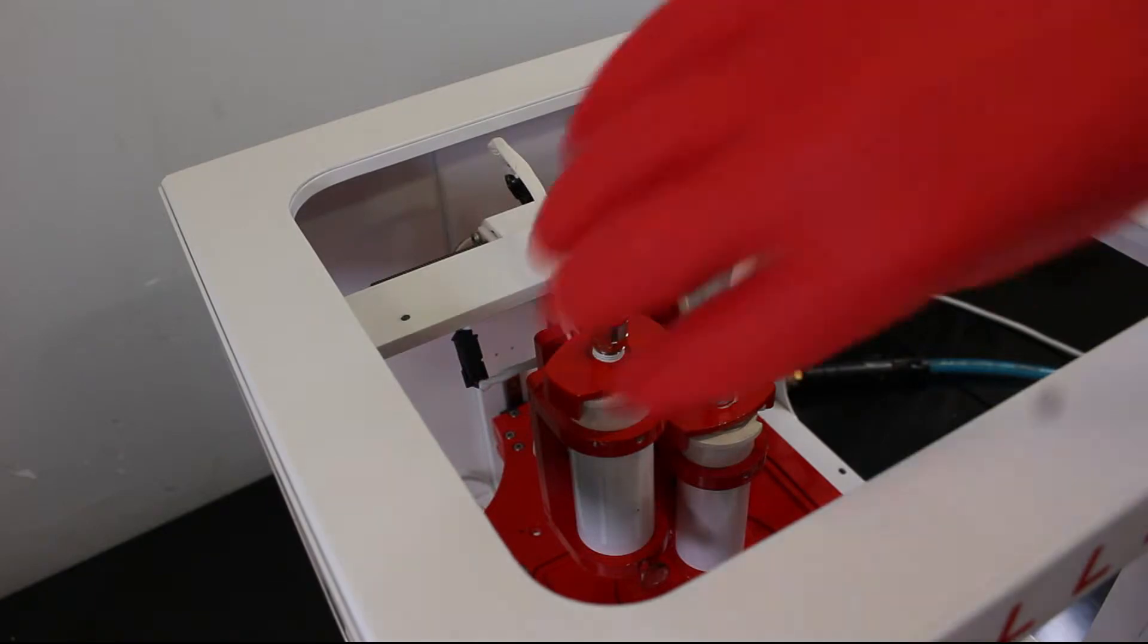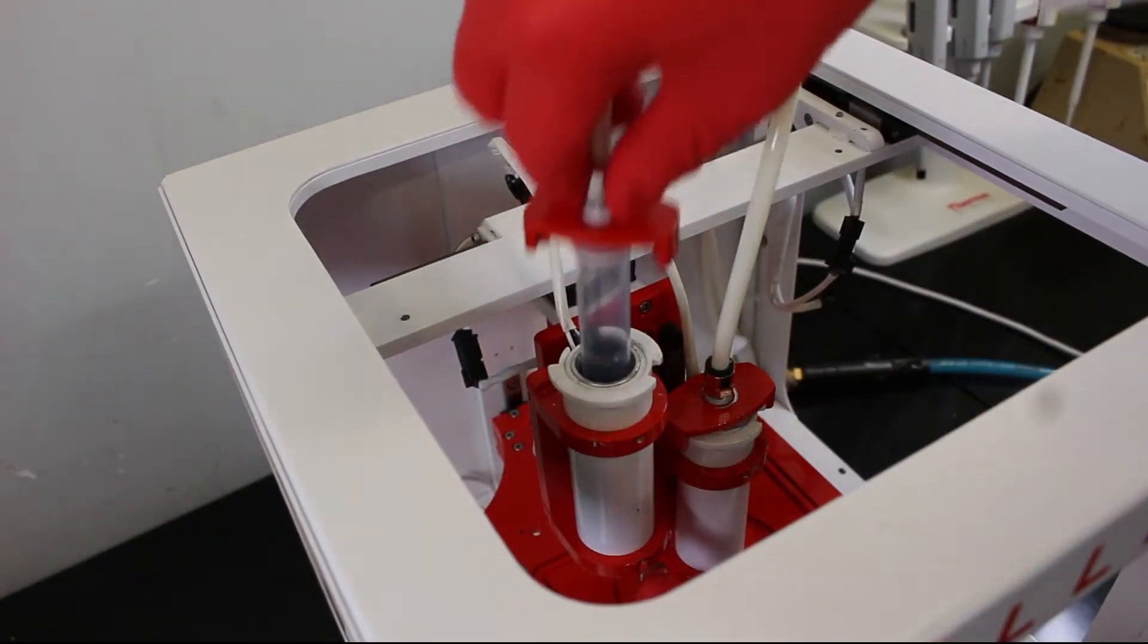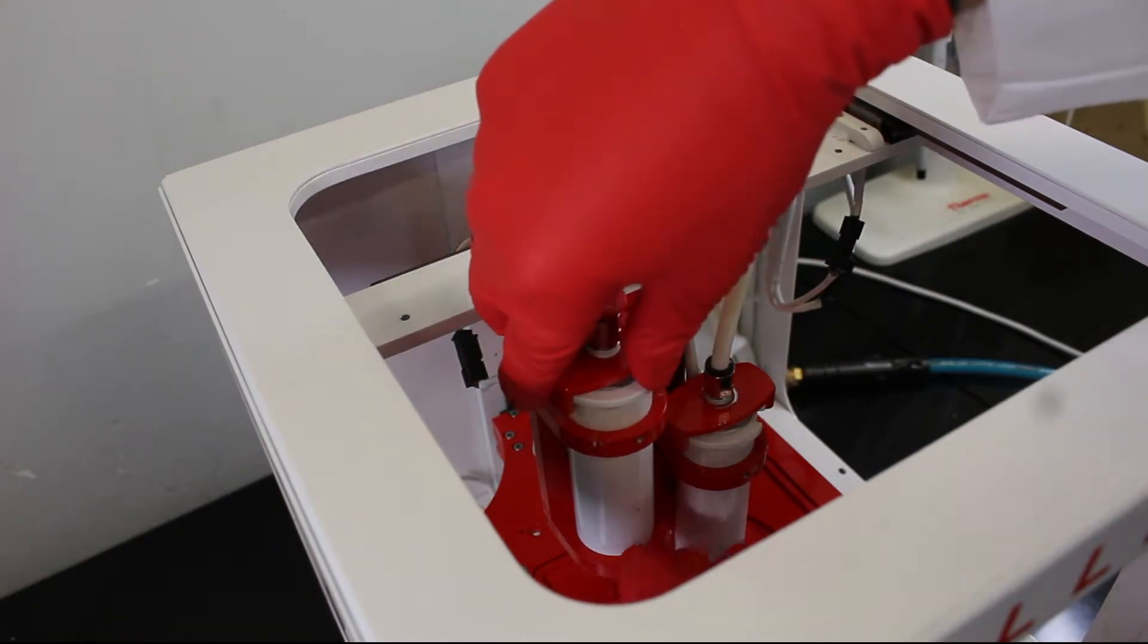Next, attach the syringe to the hose, insert it into the canister, and twist it into the locked position. Then, tighten the screw below to secure it.